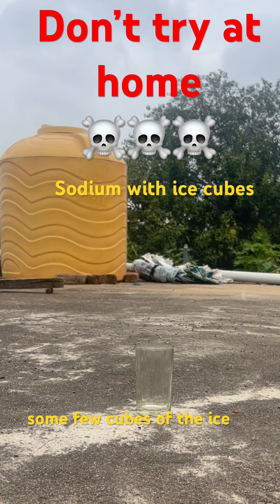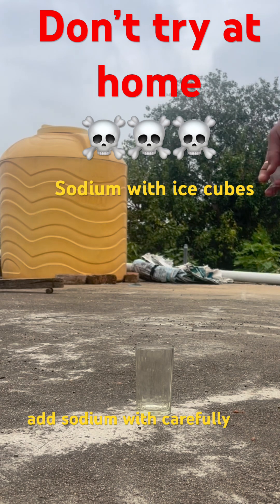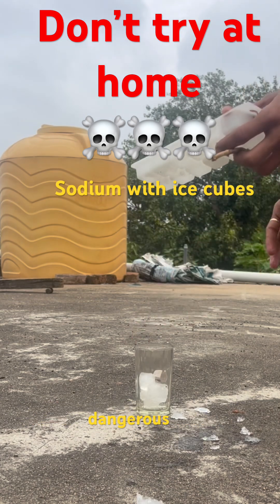First, we will add a few cubes of ice in the glass, then we will carefully add sodium. This video is for educational purposes only — don't try this at home, it is very, very dangerous.